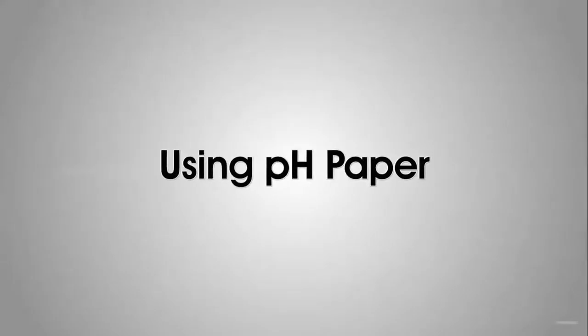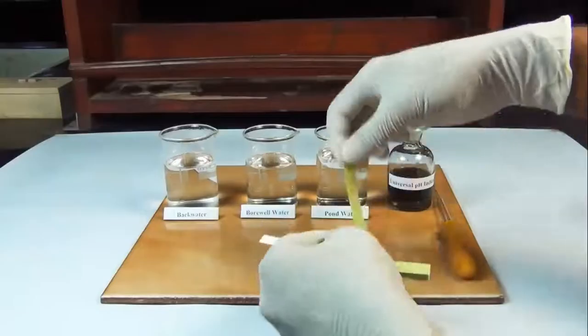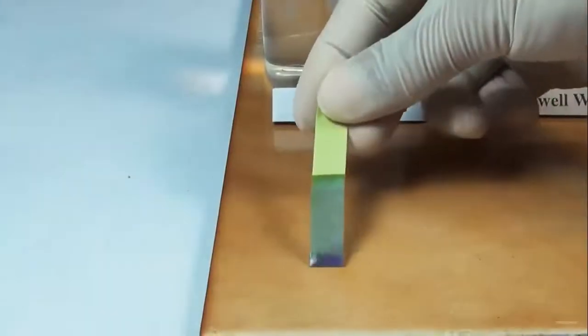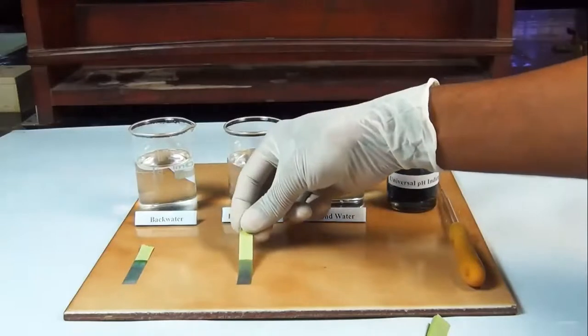Procedure: let's first check the pH of the water sample using pH paper. Take a pH paper strip and dip it into the beaker that contains backwater. Keep the wet pH paper strip on the tile. Do the same procedure for borewell water and pond water.